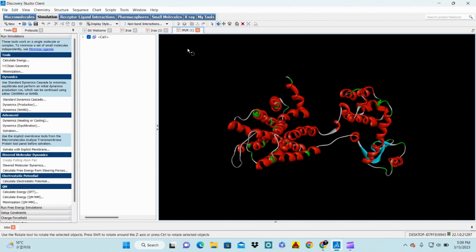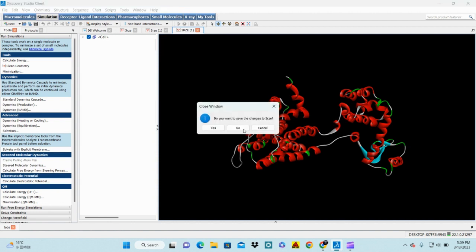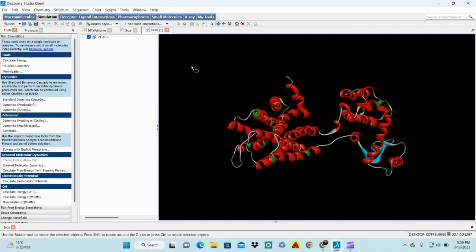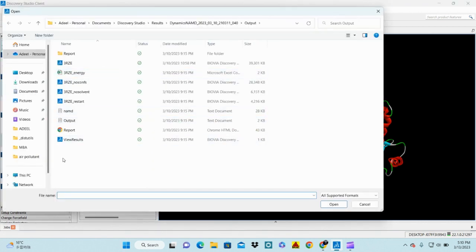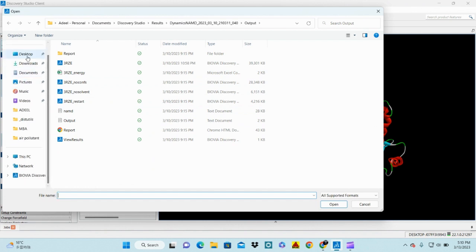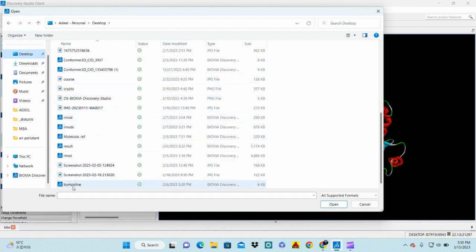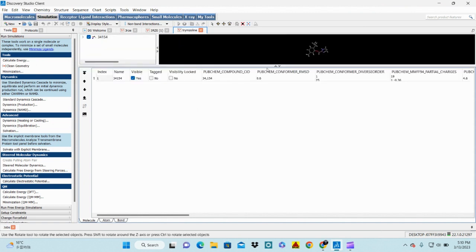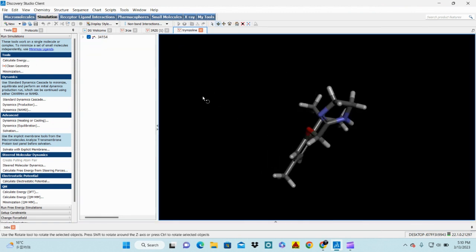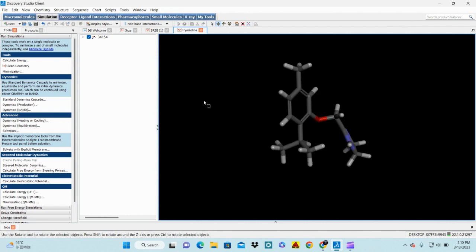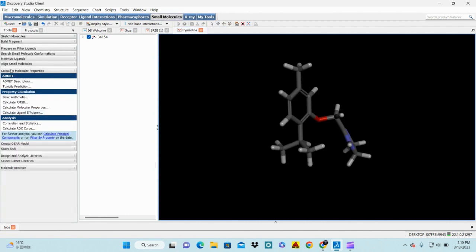For the ligand molecule, you need to first get its structure from websites like ZINC or DrugBank. We also perform two rounds of minimization on the ligand to make it more stable. I will now get the ligand molecule of interest — I select trymzoline, click on it, and it gives me the 3D structure. This is my ligand or drug molecule.